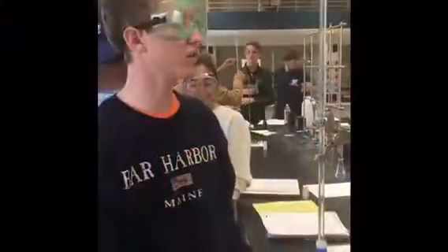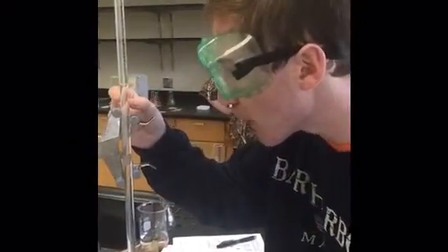Finally, we will see Forrest conduct the experiment. The initial volume is 50 milliliters. As we saw it turned a light pink color, we stopped the volume at 23.87. The volume delivered is 26.13 milliliters. I found this by subtracting the initial volume from the final volume.